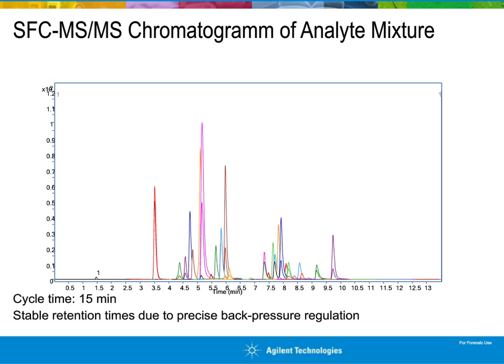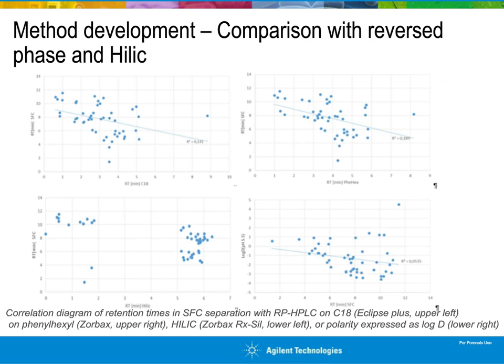given. With the more modern systems, the back pressure regulation that has to do with partly the hardware, partly electronics that is faster, can do more decisions at the same time. That helps to keep the back pressure very stable in order to be able to use an application like this in routine.